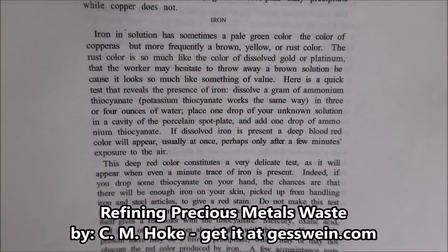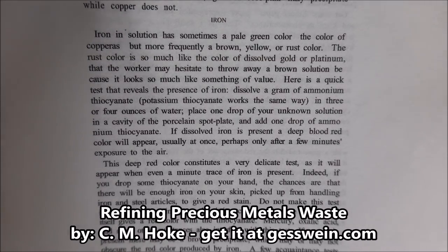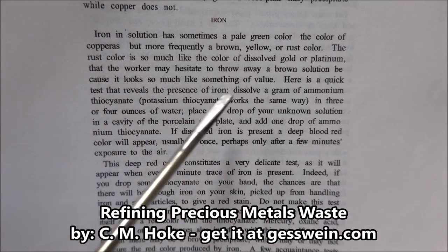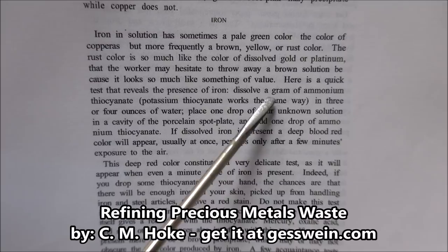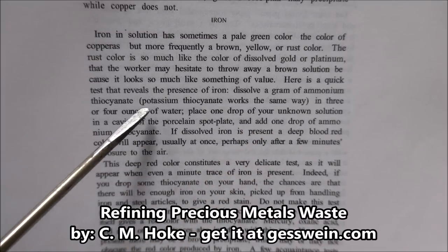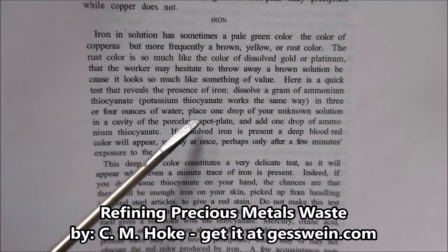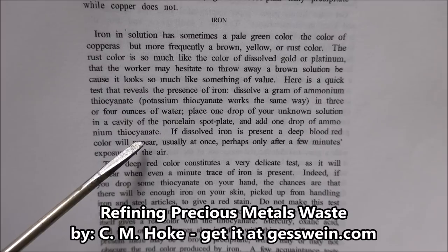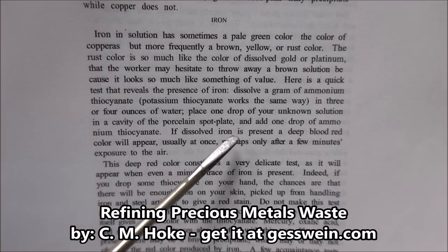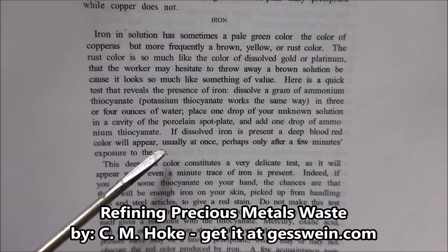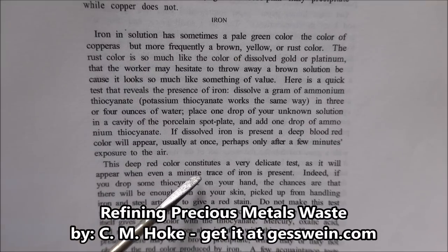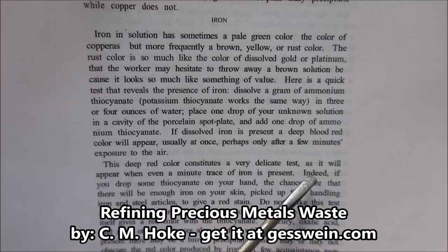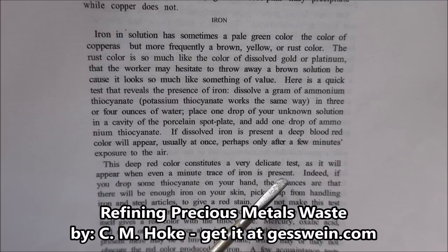This is page 100 in the book called Refining Precious Metals Wastes by C.M. Hoke. For the iron test, here's a quick test that reveals the presence of iron. Dissolve a gram of ammonium thiocyanate in three or four ounces of water. If dissolved iron is present, a deep blood red color will appear. This deep red color constitutes a very delicate test, as it will appear when even a minute trace of iron is present.